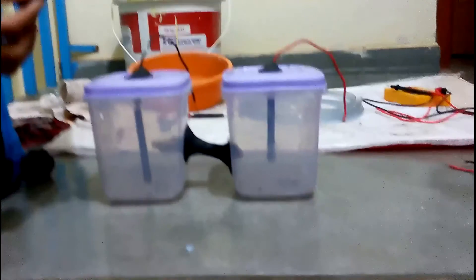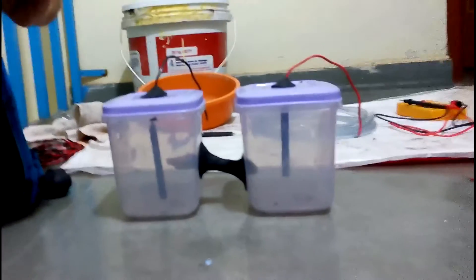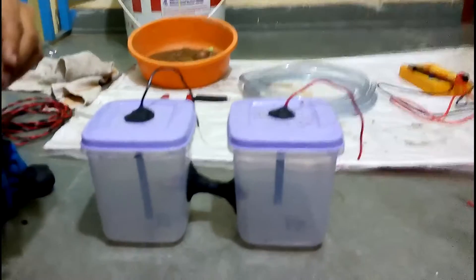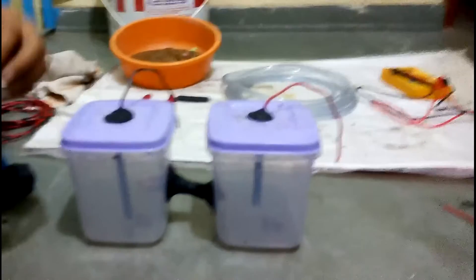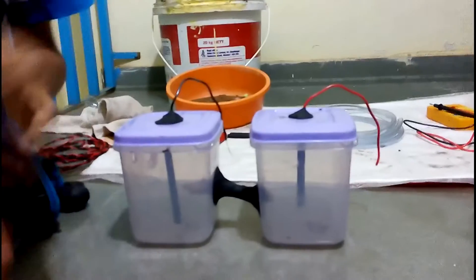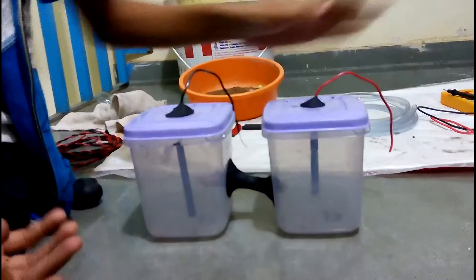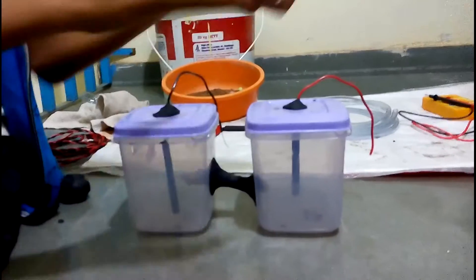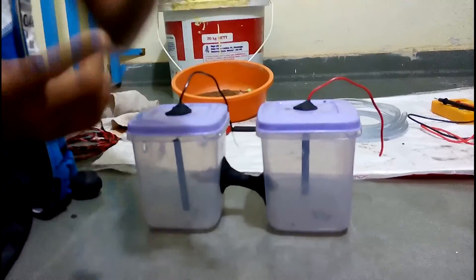I will wrap clay around the lid of the cathode chamber so that no air enters. Don't get confused between the colors — this is the cathode. I will wrap it here and we'll continue to the next step.